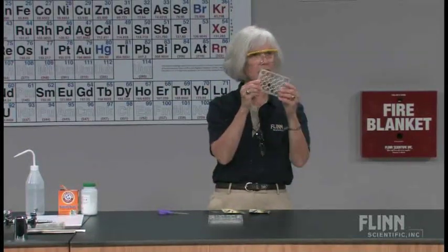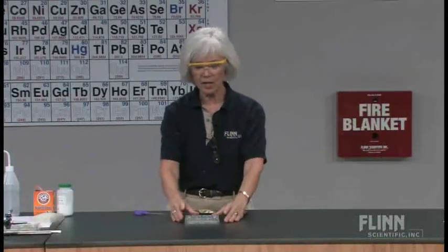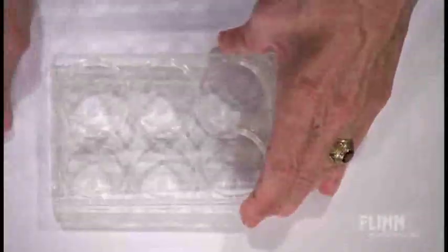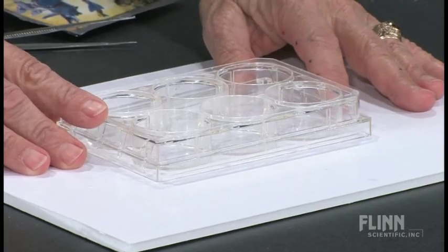my students, if they are doing the experiment, are going to use a 24-well plate, because this is probably the most common piece of equipment that students would have as far as small-scale reactions. For today, we're going to look at it in a 6-well plate, because that's a little bit easier to see here. With our 6-well plate, I'm going to place it on a white background because this will make our reactions easier to see.